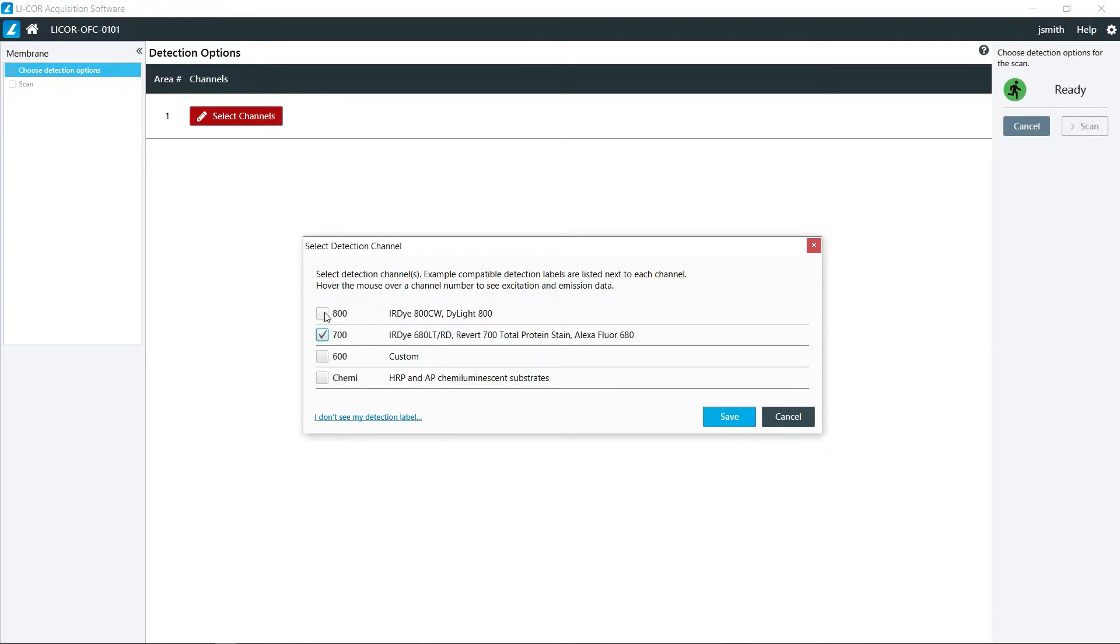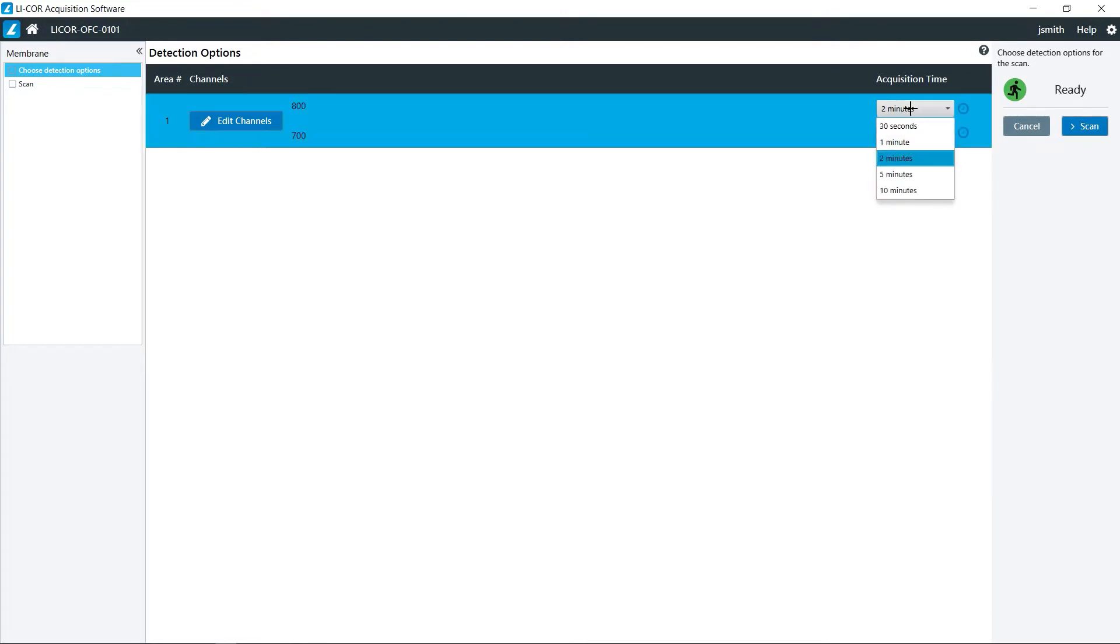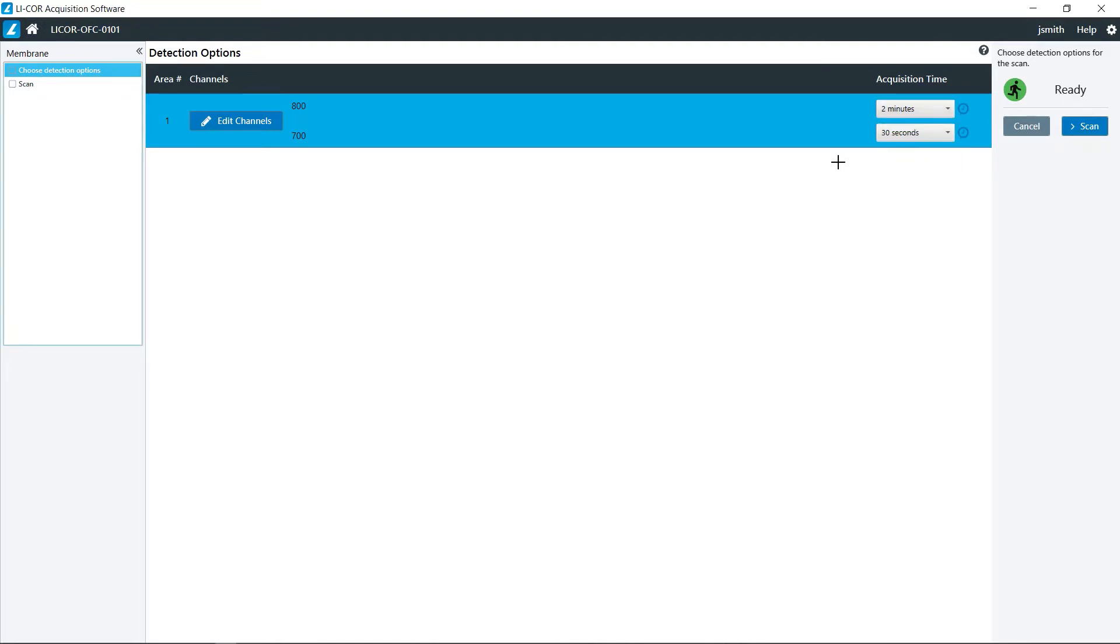I'm just going to choose the 700 and 800 for right now and click save. And then here is where you can set your acquisition time. If you are doing a one target analysis in the 800 channel and your marker is in the 700 channel, you could just do a quick 30 second exposure in the 700 channel so that you can see your molecular weight markers and then do anywhere from 2, 5, or 10 minutes for your fluorescence.